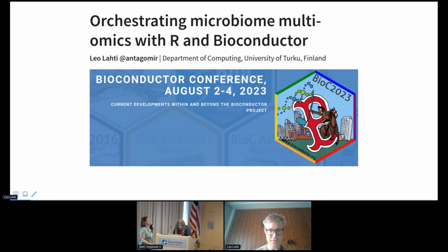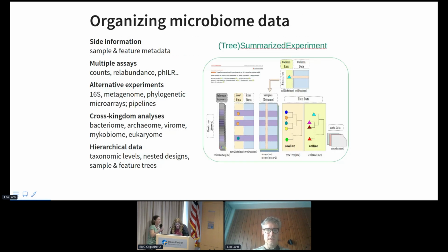And thanks for this opportunity to present our recent work on microbiome data science and microbiome data integration using the state-of-the-art data containers in Bioconductor. And this is, of course, joint work with several people. I come back to that. But let's start by thinking for a moment about the needs to organize multi-assay microbiome datasets.